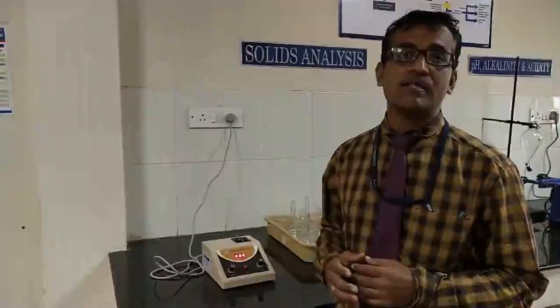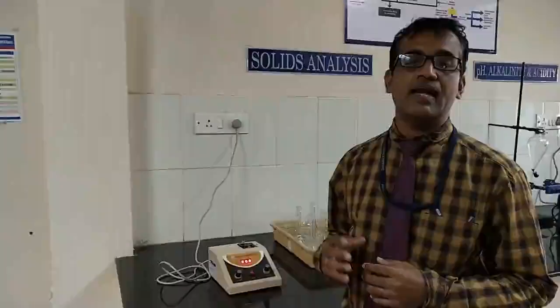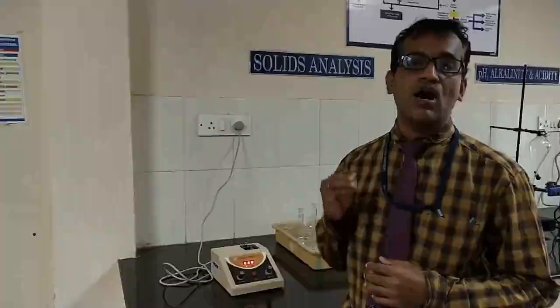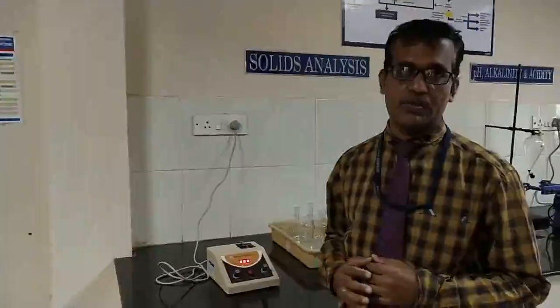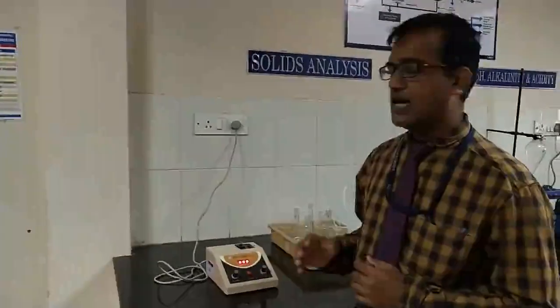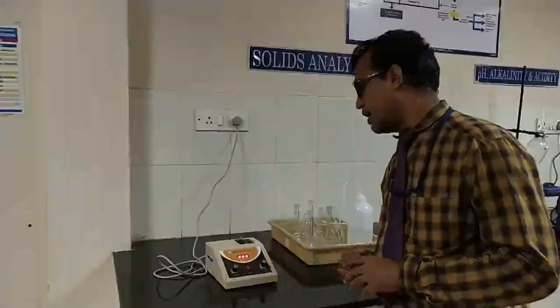That wavelength can be measured and quantified, and then we can find out how much of a particular component is present in that wastewater. So analysis of any wastewater can be done by using the digital colorimeter.